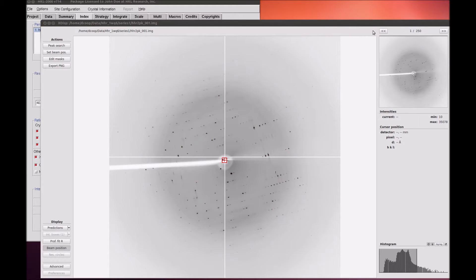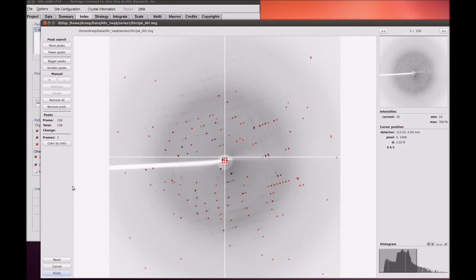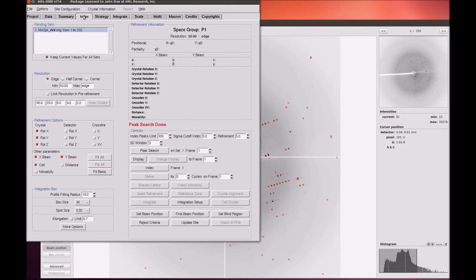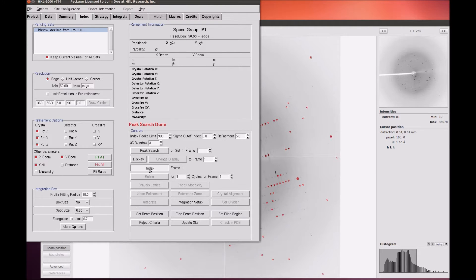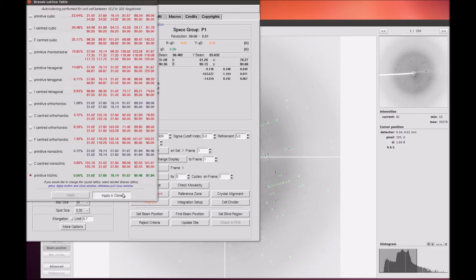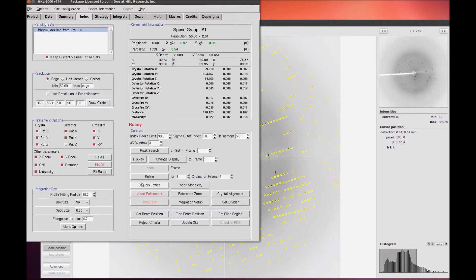The remaining features of XDispQT require that you have indexed your data. See the HKL Research Indexing and Scaling video tutorial for details on how this is done. Briefly, I select the Index button, refine the basic parameters while in P1, use Fit All to refine all parameters, then revisit the Bravais lattice.